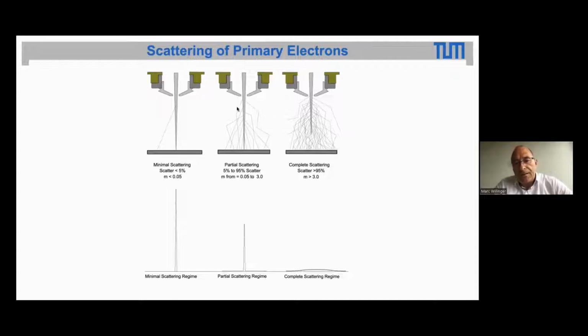Whereas all the scattered electrons, they get scattered randomly. They only give rise to some kind of background signal. So you get a background signal from the scattered electrons, but as long as you still have a few percent of the electrons that are getting focused to one point, you can still get an image. And that is actually amazing: with only 5% of the electrons remaining unscattered, you can still record an image.